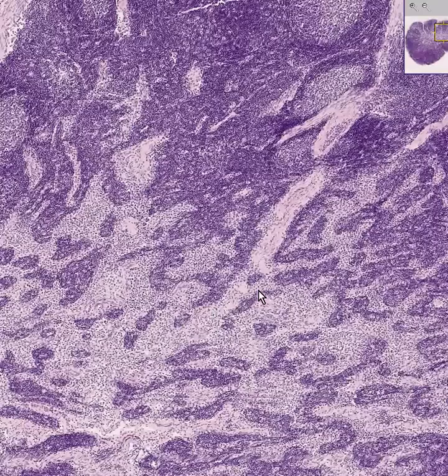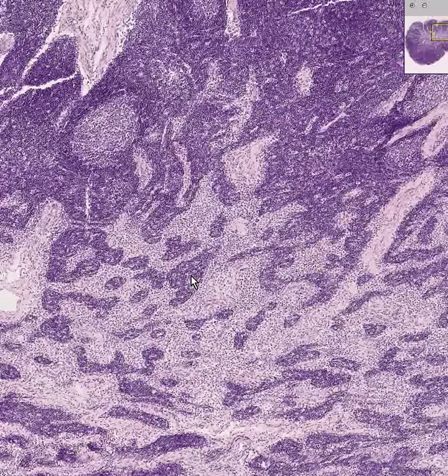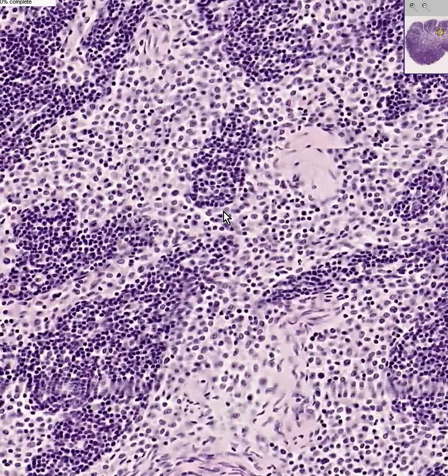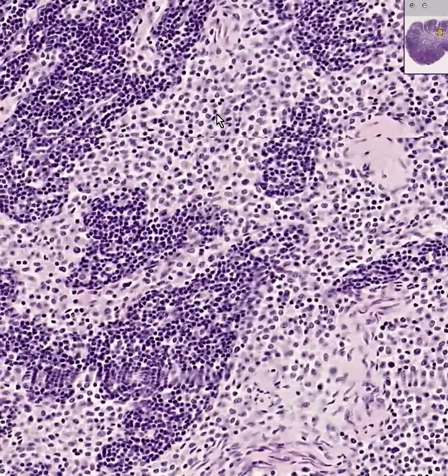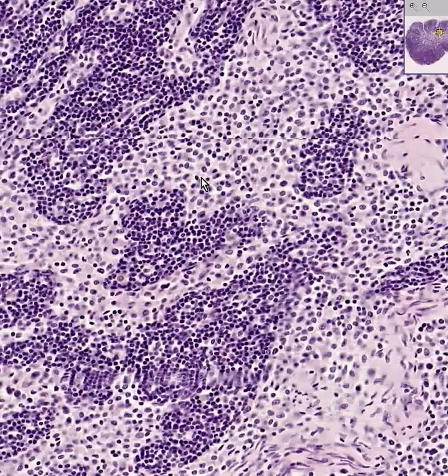Here is the extension of the subcapsular sinus along the trabecula to form a trabecular sinus. And last but not least, in the medullary portions of the lymph node, the sinuses continue as these rather linear medullary sinuses, in which you have islands of medullary lymphocytic cords. The vast majority — 99% — of the individual cells are lymphocytes. You can probably see that some cells look a little larger, more nucleated, and more vesicular than the lymphocyte; these are probably macrophages.